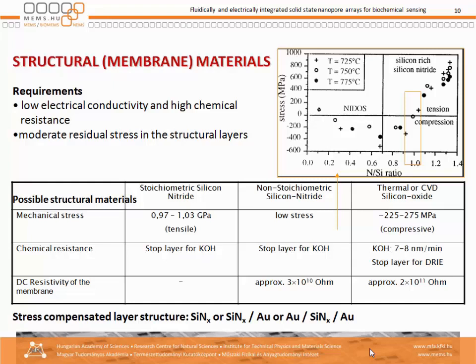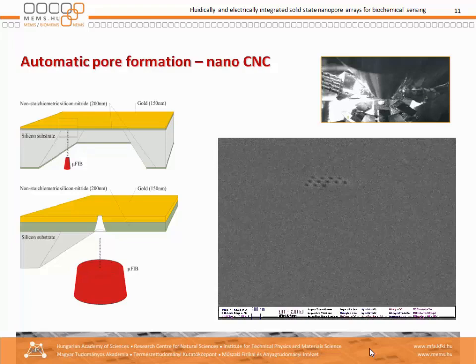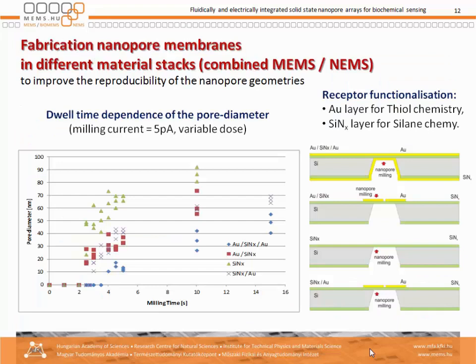Well-known tension and compression combinations have to be applied to achieve a low-stress membrane, which can support drilling by the focused ion beam. We have to use gold in order to get the chemistry we are interested in. These are the drilled holes, and you can see that multiplicity can be automatically prepared in the membranes within a few minutes.